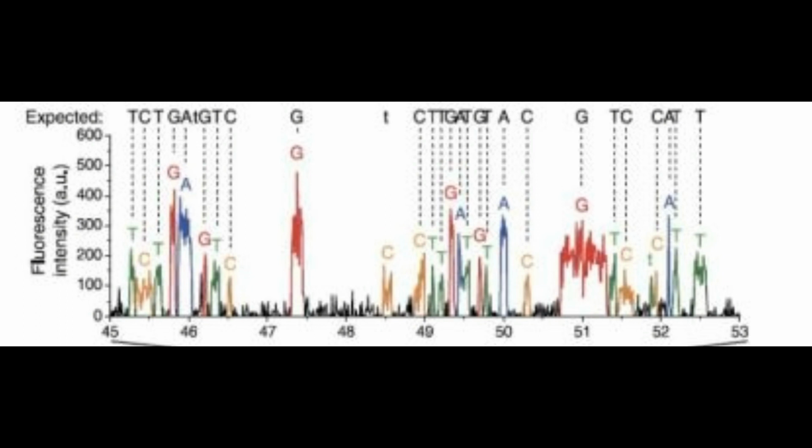The only disadvantages that it has are that it is an expensive instrument, so it needs a high performing computer for data analysis and special algorithms, and it also has a high error rate with raw reads, but these are very random, and we can provide more methods to cross check the output of this data.